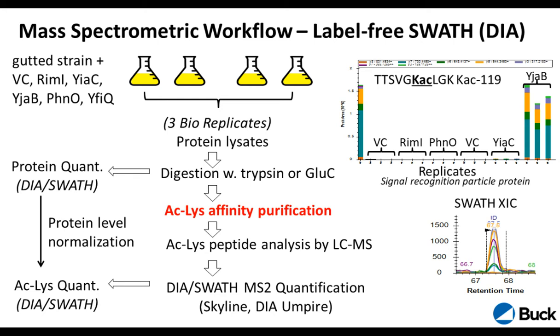So with the data-independent acquisition, or SWATH, we can do identification of the acetylation sites in parallel and at the same time as the quantification. So that was a nice throughput we could do on the mass spec end, because we had quite a few acetyltransferase targets as well as biological replicates. So the number of samples would increase quickly. On the next slide, again, here you can see the SWATH-type data.